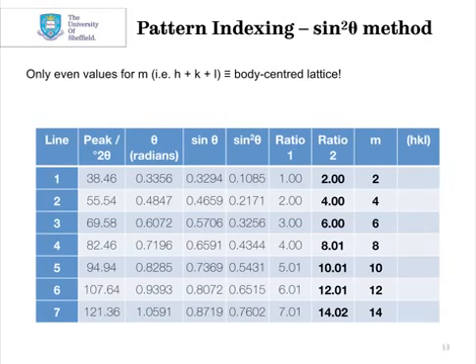What you can notice from this is that h plus k plus l, which is effectively our m value, are all even numbers. So if they're all even values for m, that means that what we're looking at is a body-centered lattice. There are other rules for different types of lattices, but in this case it's a body-centered lattice, which fits with what we were expecting.